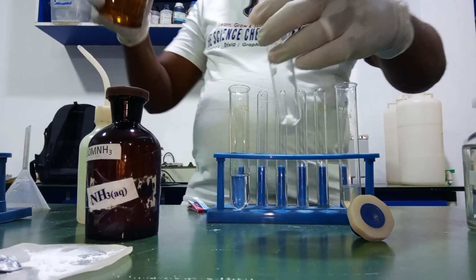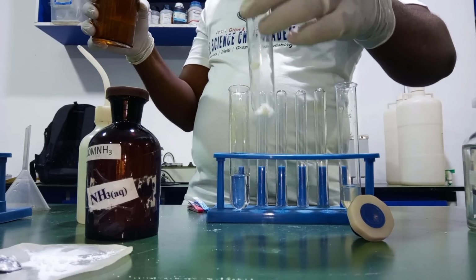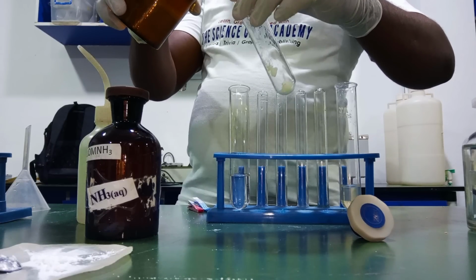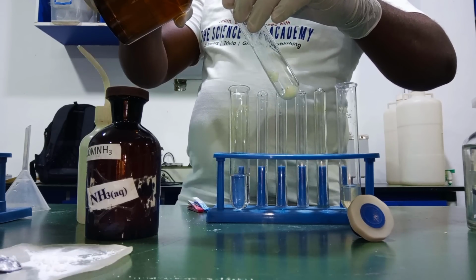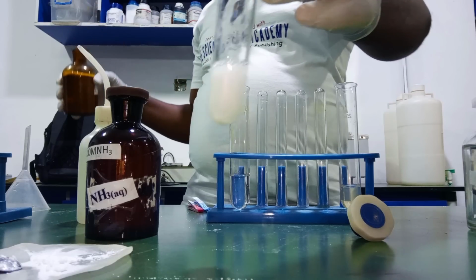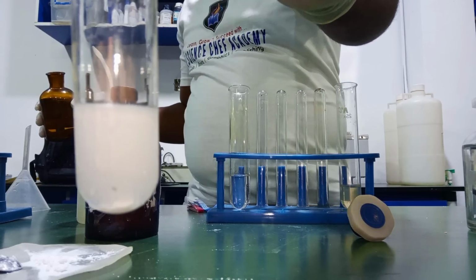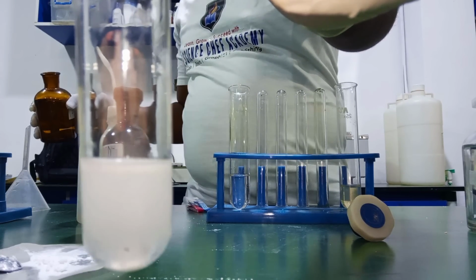Now, given that this is a carbonate, lead(II) carbonate, we expect effervescence or bubbles to occur, effervescence of a colorless and odorless gas. Wow. Can you see that? Can you see the effervescence? Can you hear the sound? Isn't that beautiful?